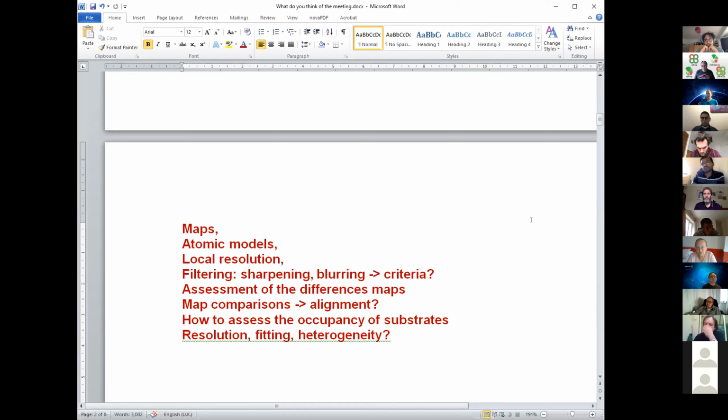On this level, local resolution became extremely important. We have not discussed that so much before, but during only the last hour of discussions, we suddenly turned to the fact that local resolution became extremely essential. It's more important compared to just the general Fourier-Shell correlation. Integrative and general assessment of the Fourier-Shell correlation is important, but local resolution should be equally represented. I do believe that with each map deposition, we have to show the local resolution maps, at least in pictures.